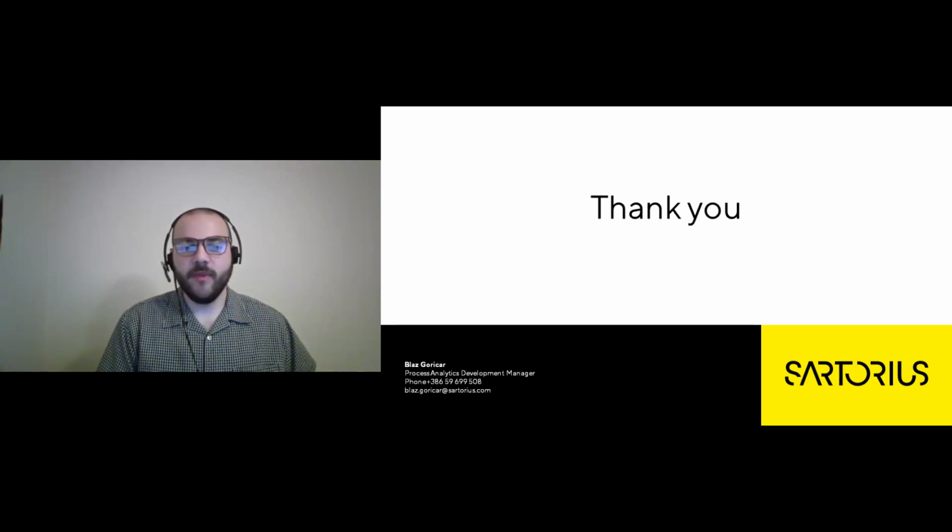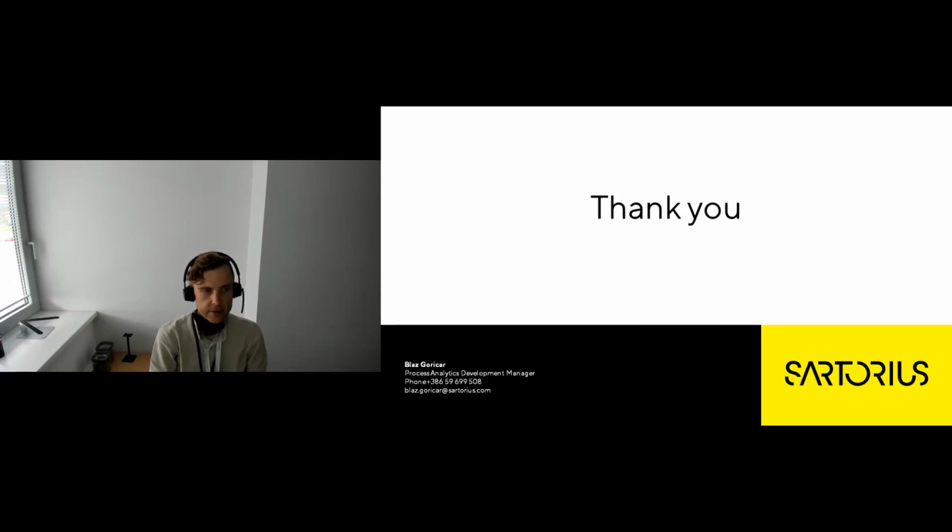The last question for the webcast is, can the peak names be added automatically, not manually, for all injections in one run? Yes, so the software provides mathematical templates that you can make. So you would just have to make one template for your first sample, and then that template can then be applied to all the other samples automatically. So that way, it's a very straightforward and easy process to do not just peak naming, but also peak integration, for example.